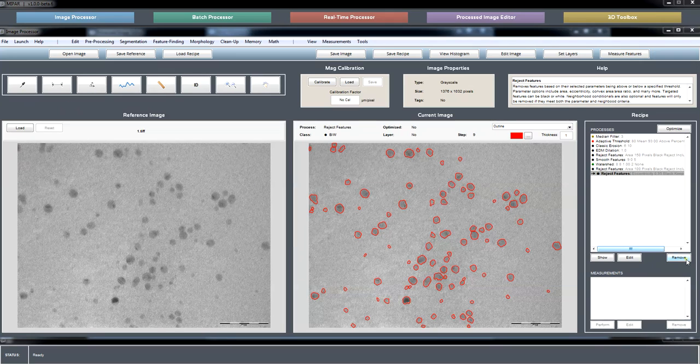Johan had proposed, and sorry, I didn't mean to ignore you, Meg. Yes, MIPAR does support a wide array of input files. We've always supported TIFFs and bitmaps and PNGs, JPEGs, all the usuals. A couple of versions ago, we added support for all of the bioimage formats. If you check, I think it's beta 4 or 5's release notes, there's a link to the bioimage formats open source website, and there's something like over 50 different formats in that category that we now support, including DM3 files, OIFs, LSMs.